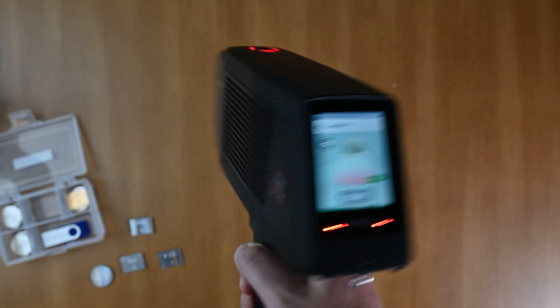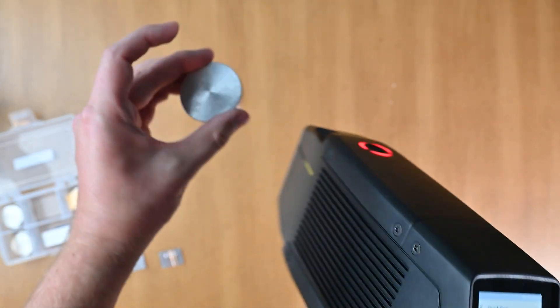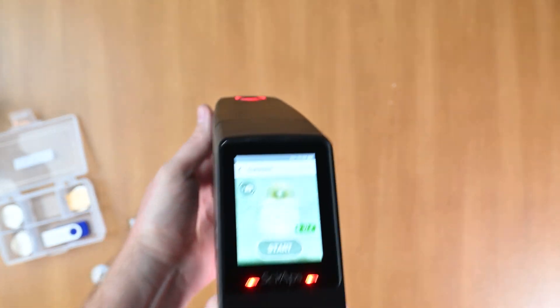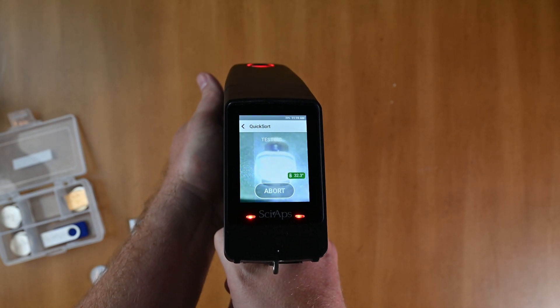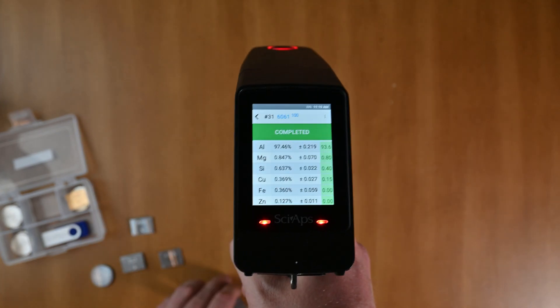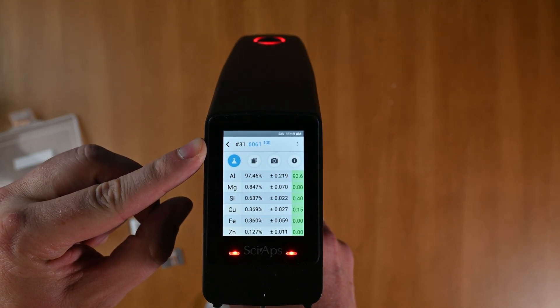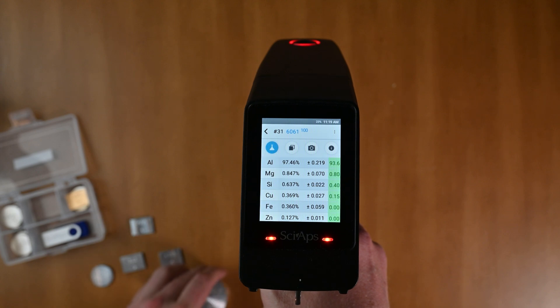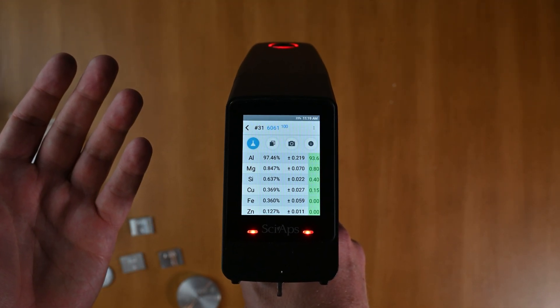That's how you do drift correction. As a bonus, here is a piece of 6061 aluminum — I'm going to approach it and actually test the sample. You can see on the top of the screen we have a 100% match to 6061. This is a reference material so we know what it is and we know what the chemistry is — and we can say that our drift corrections were successful.